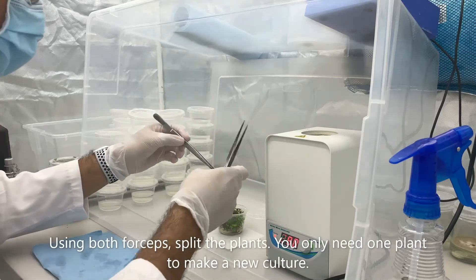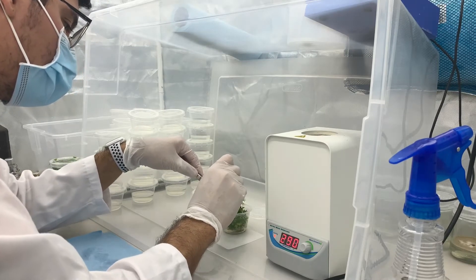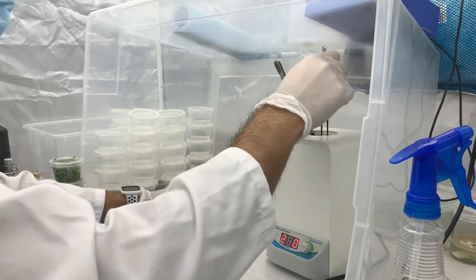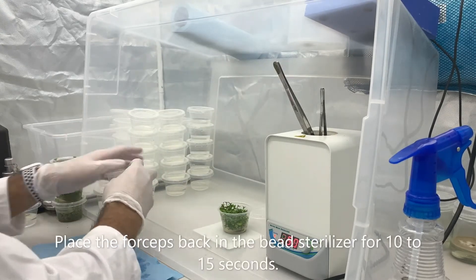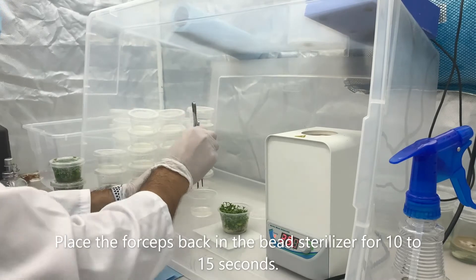Using the sterilized forceps, you can now begin splitting the plants. Remember, you only need one plant to make a new culture. In between splitting the plants, always place your forceps back into the bead sterilizer for 10 to 15 seconds each time.